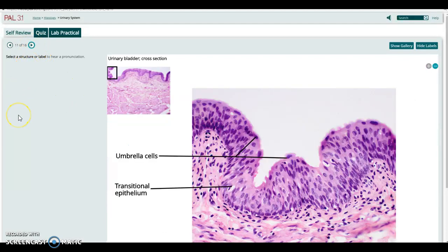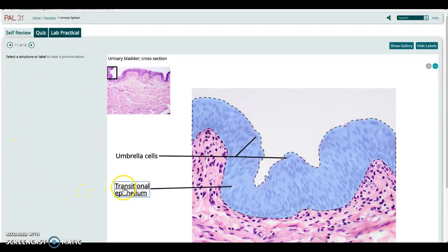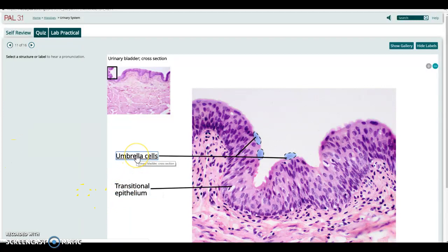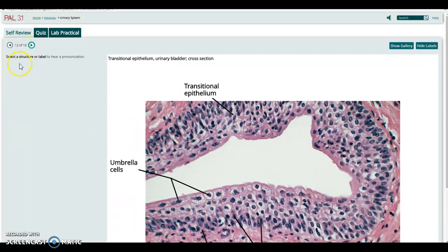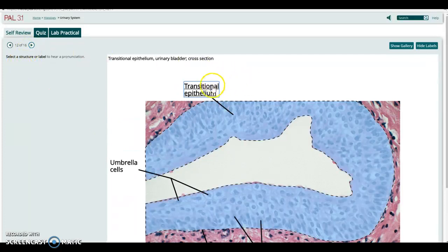That's showing that transitional epithelial layer up close, much more clear than we saw before, those little umbrella cells on the surface. And again, this is just a slightly different stain, showing the transitional epithelium on the inner surface of the bladder. So that's pretty nice.